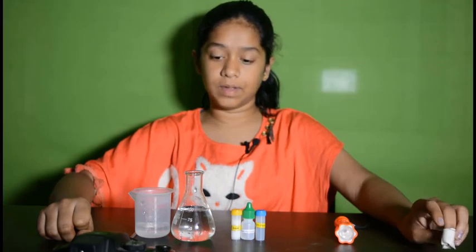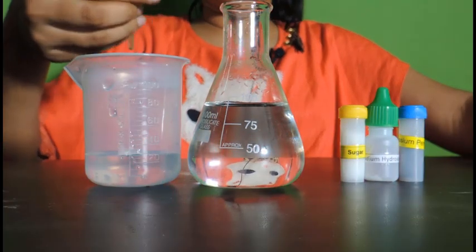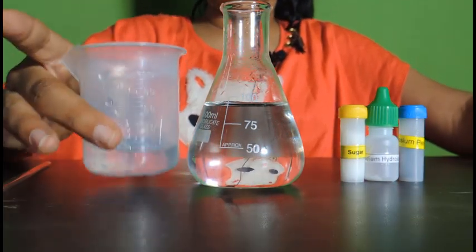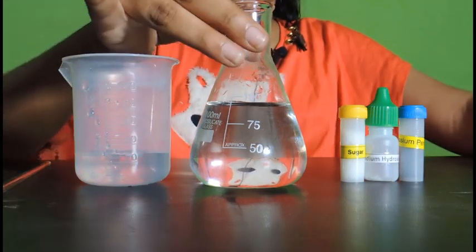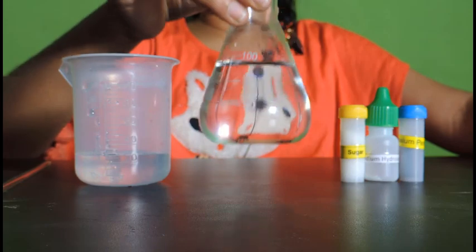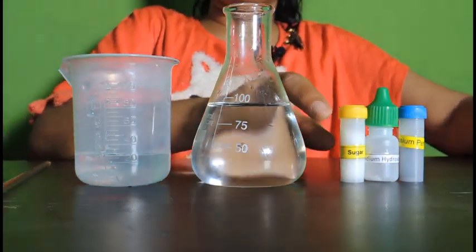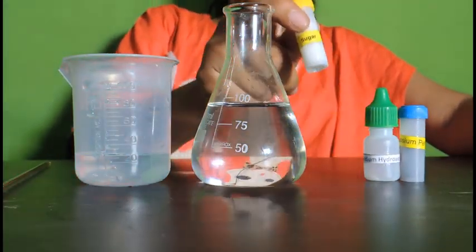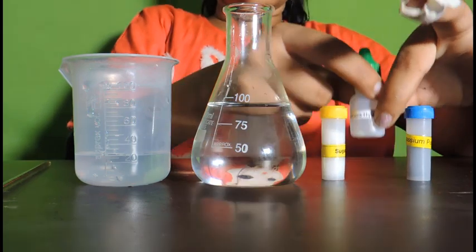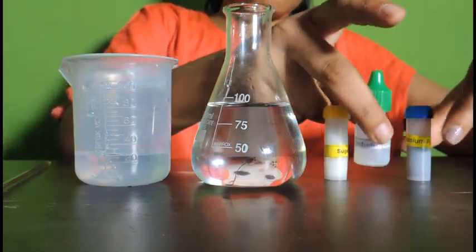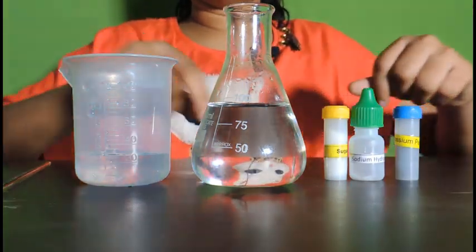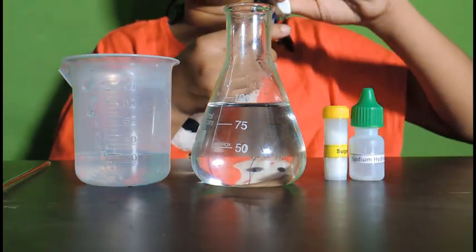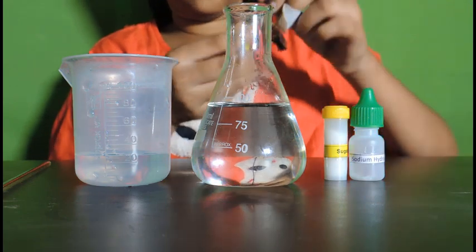The materials required for this experiment are stirrer, beaker with 20 ml of water, conical flask with 100 ml of water, and the chemicals required are sugar, sodium hydroxide, and potassium permanganate.